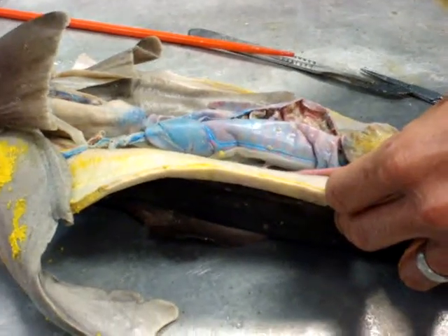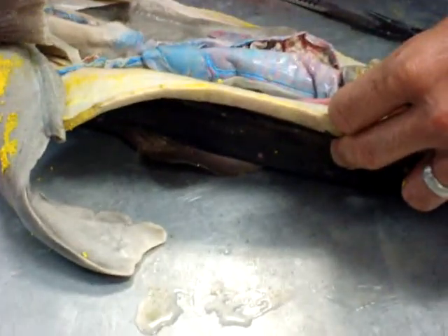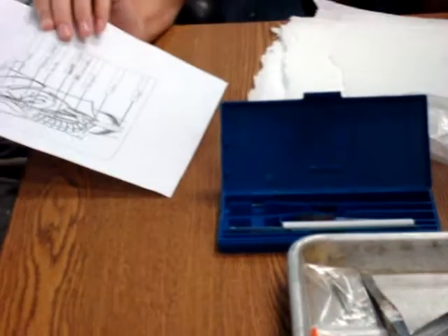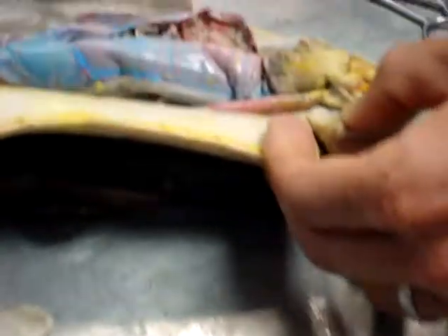Okay, let's see what it says about it. Would this right here be the rectal gland? It would look like... Yes. It's very distinct on here. That's definitely the rectal gland right there. The one that looks like a V sort of? It is. Yep. It's very easy to see on these guys. Oh, wait. Where would you put it then? I just draw it in there, to the side someplace.